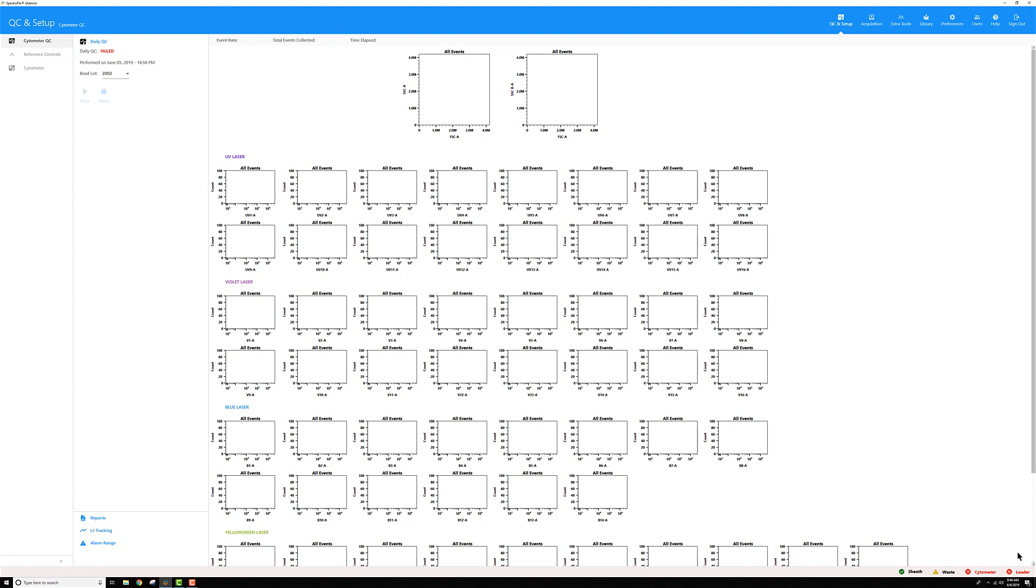Same thing for the loader here. I don't have the loader turned on or powered on right now. And since everything's off, you can see all my buttons are disabled.